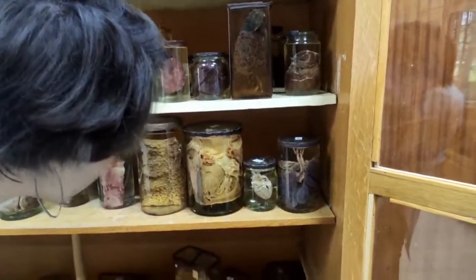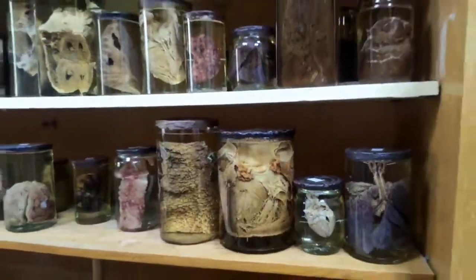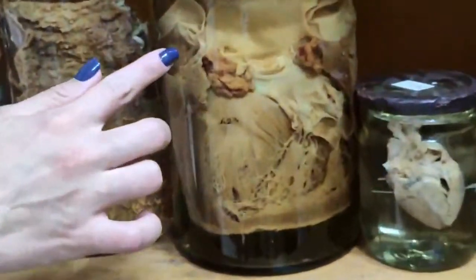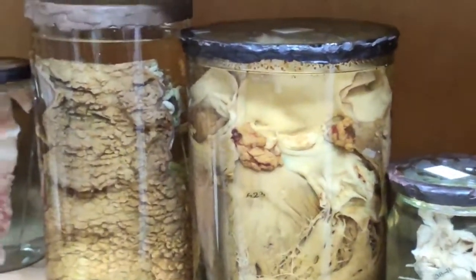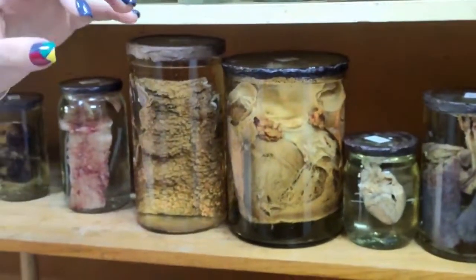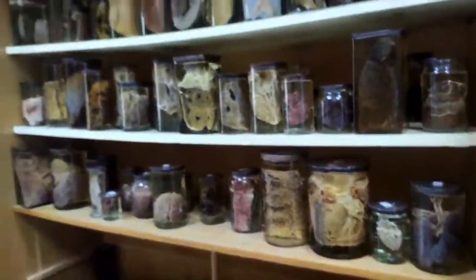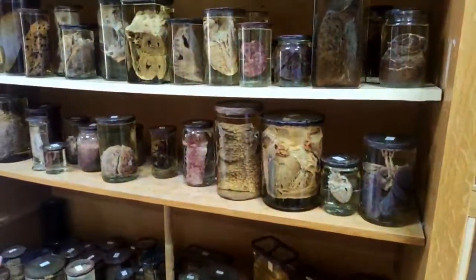The next one is eccentric hypertrophy of myocardium, and I guess, what is it in your list? Septic endocarditis. Okay, also septic endocarditis. So we can see also involvement of the valves, and you can see that on the surface of the valves there are vegetations. Vegetations are accumulations of thrombotic masses and bacteria in septic endocarditis. So they are quite big, and of course normal blood function is lost here in this patient, and he has eccentric hypertrophy of the myocardium.